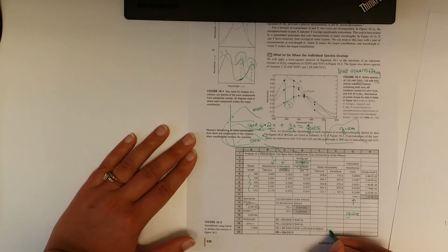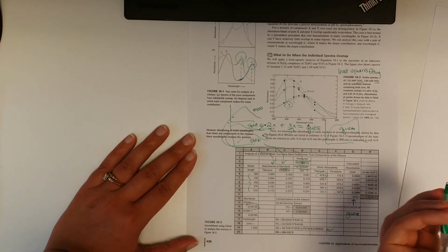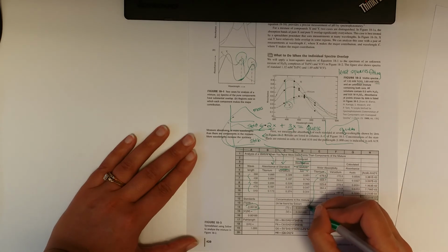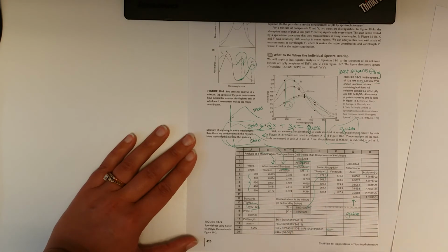This is literally saying I'm going to take my absorptivity times some, I don't know, guessed value. What's the guessed value? We're going to input some hypothetical concentrations. So I'm going to guess that the concentration of titanium is 0.001.